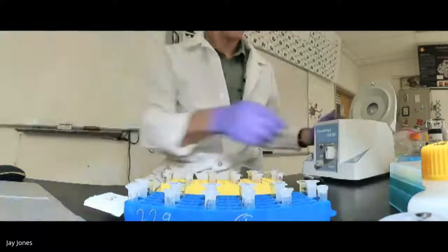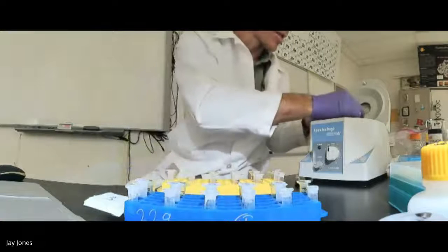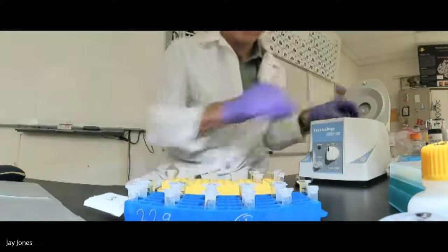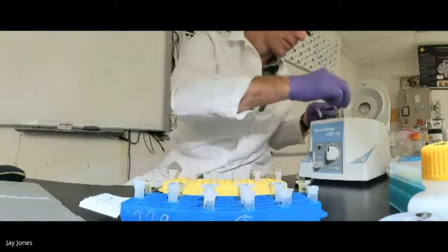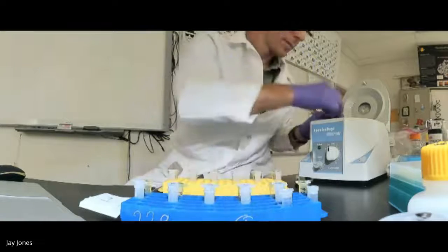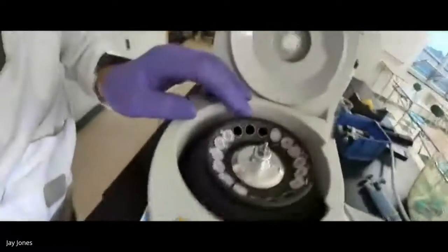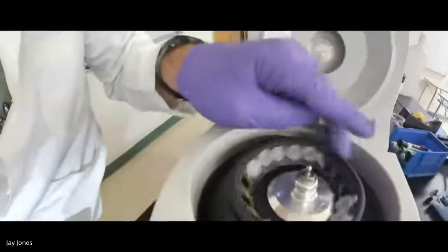I'm going to put these in this big guy over here. All right, here we go. I'm going to put period 12 on one side, and I'll put period 3 on the other. Let me show you. This is period 12, and the other side is period 3. We're going to spin these for 5 minutes.